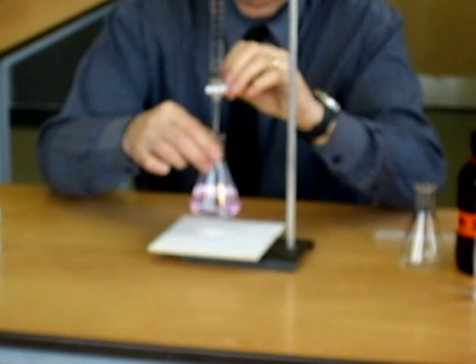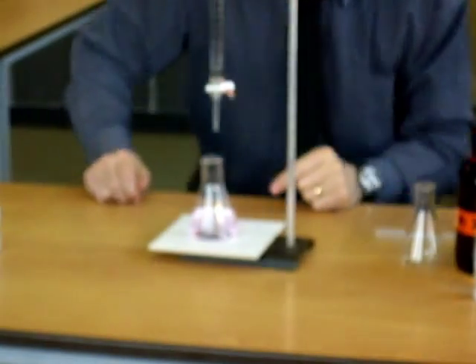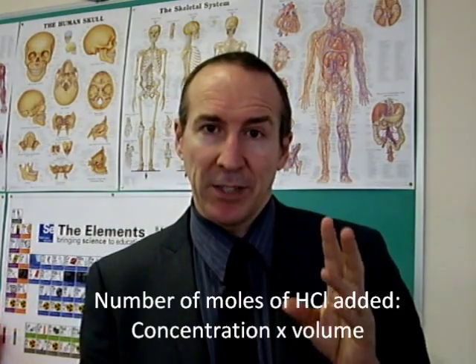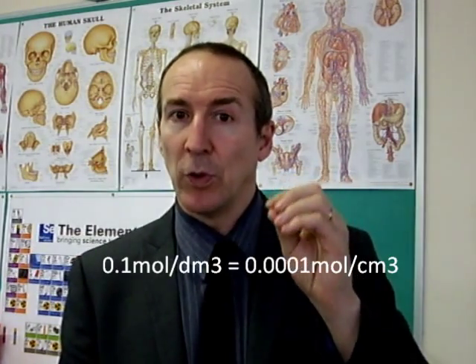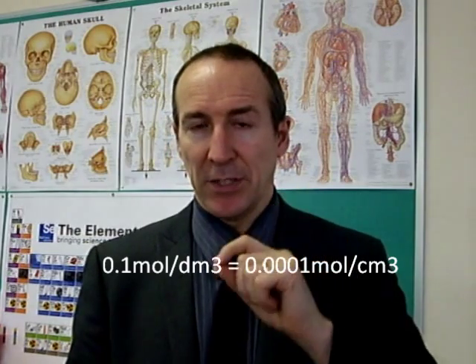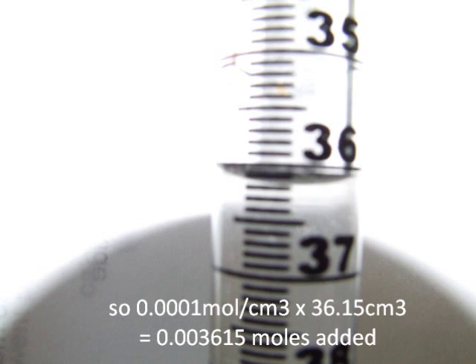Here, phenolphthalein has gone colourless, so I have reached neutralization. So the hydrochloric acid that we had here has 0.1 moles per litre, 0.0001 moles in every centimetre cubed. The titer here was 36.15 centimetres cubed, so 36.15 lots of 0.0001 moles.